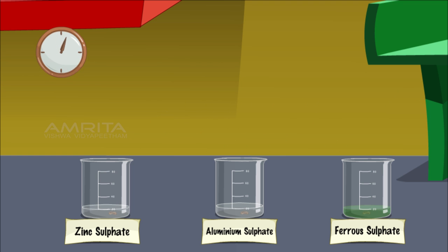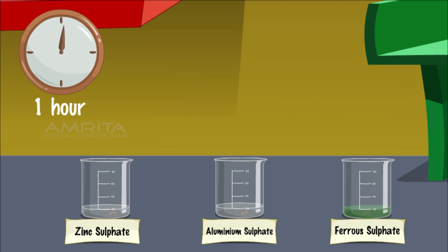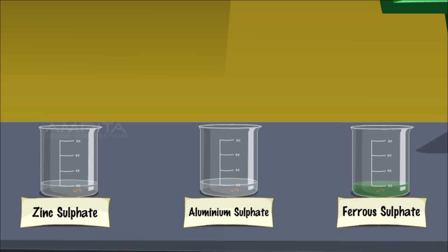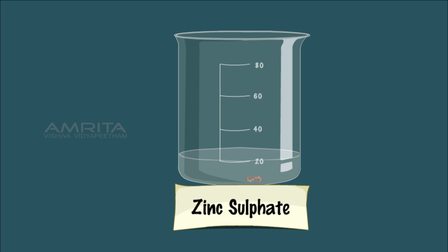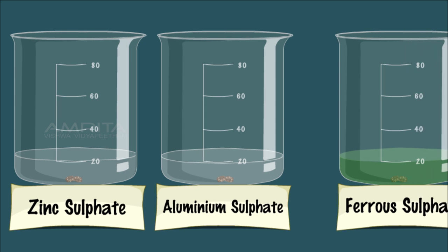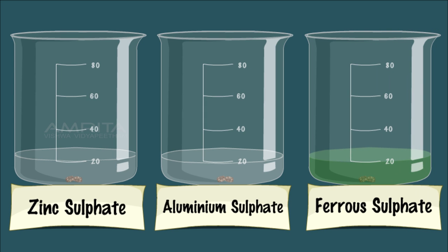Leave the beakers undisturbed for one hour and note the changes in colour of the solutions and the appearance of the metal. There is no change in colour of the three salt solutions nor in the appearance of the metal pieces. This indicates that Cu is less reactive than Al, Zn and Fe, so it cannot displace these metals from their salt solutions.